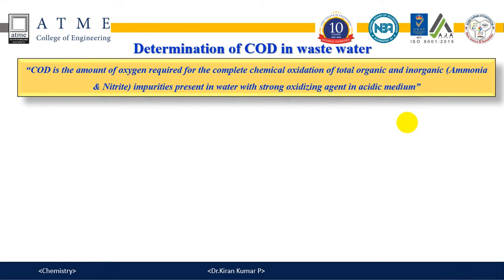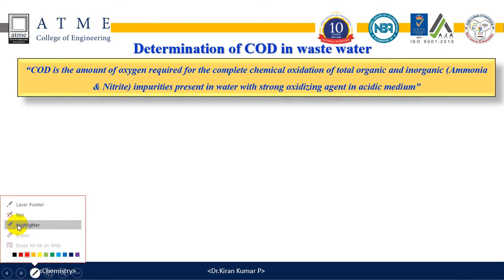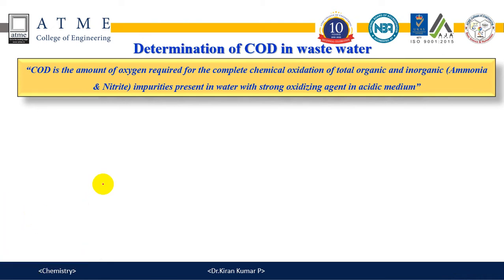So COD, the expansion of COD is chemical oxygen demand. COD is the amount of oxygen required for complete chemical oxidation of inorganic compounds and organic compounds.